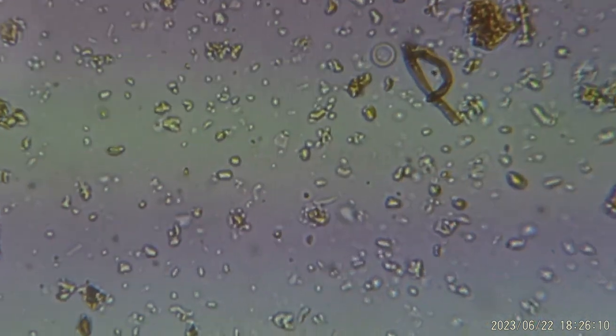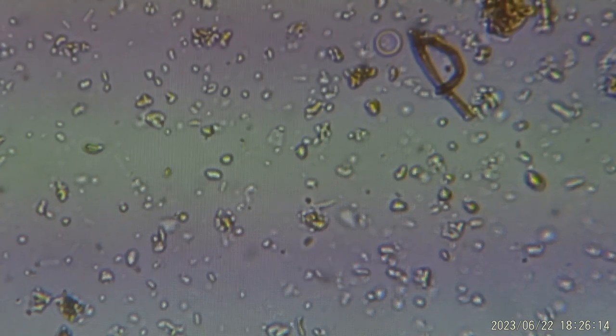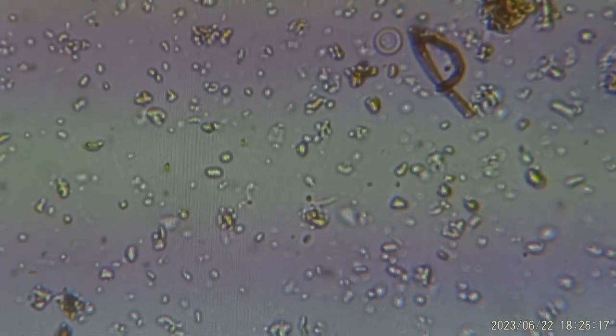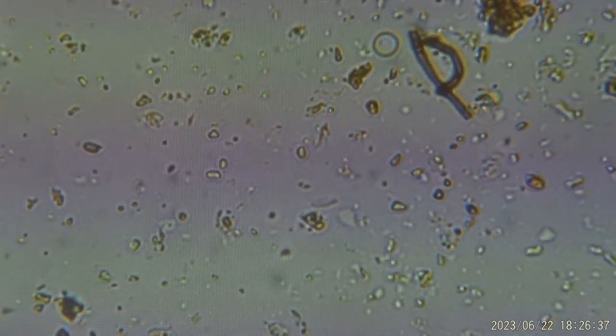That looks like a fungal hyphae to me, actually maybe two separate ones, just overlapping. Even though we put in a drop here, if you look at it microscopically, there's a lot of water in here. That's why when you zoom in and out, you're going to see different layers of what we're seeing. This is actually at the top layer. We can still see bacteria here, right? And if you zoom all the way in, you'll see different strata of the slide.